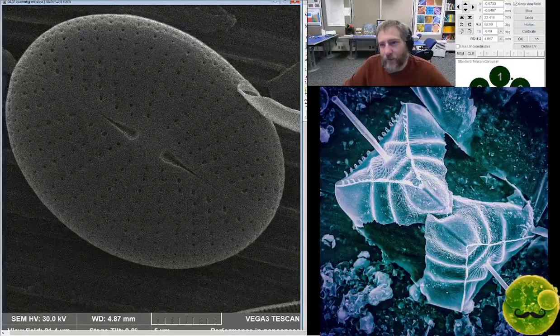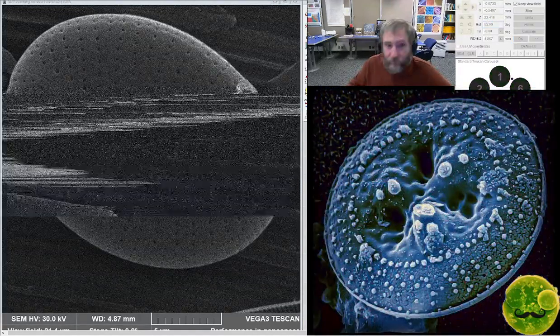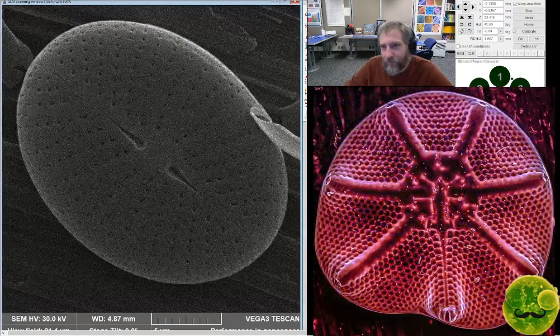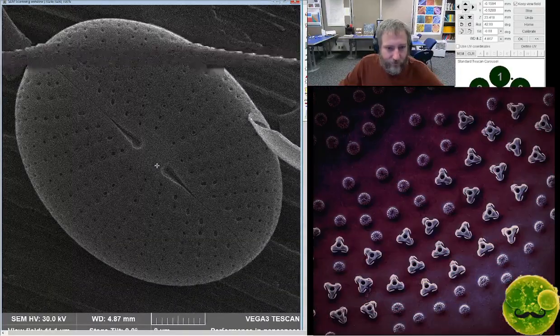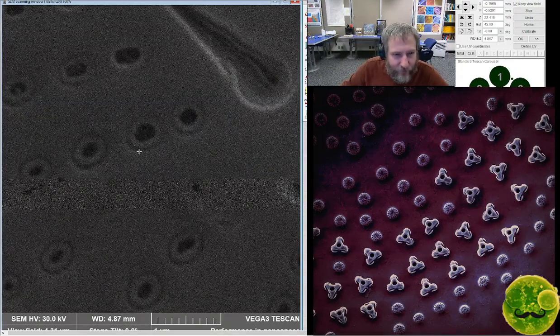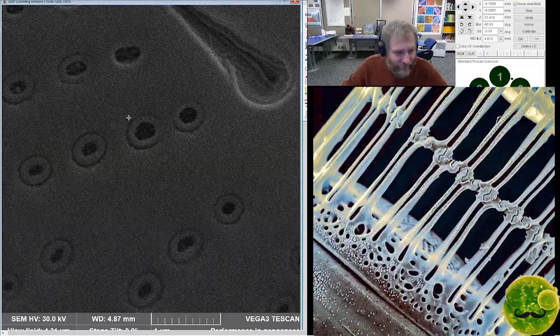I need to turn it a little bit. I'm going to get a picture of it. Let's go backwards 5-7 degrees. Not far enough. Better. Let's see what we can do about getting these little tiny holes in focus. Ooh, there's something interesting inside. They come with presents.